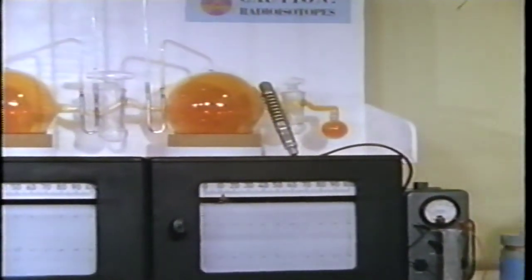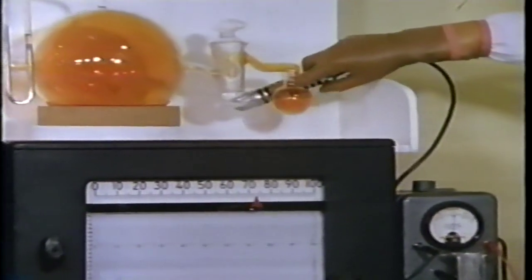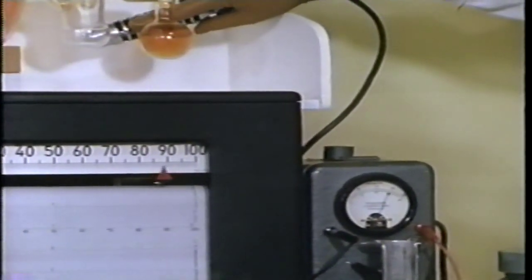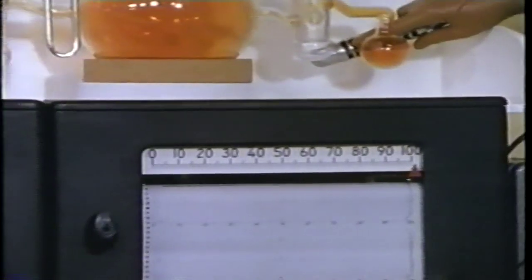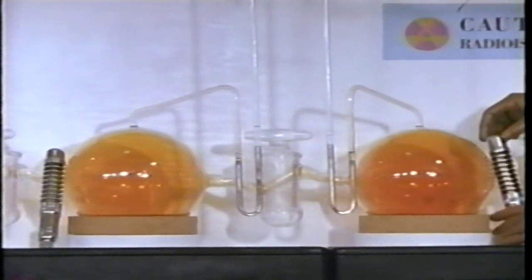Beside each bulb, there is a radiation detector, a Geiger counter. When this detector is near a source of radioactivity, the number of atoms disintegrating per second is shown on a counter meter. At the same time, a recorder makes a graph of it on a slowly moving chart. The recording pen is right underneath the indicator arrow. Now we have a way to follow movements due to individual bromine molecules.